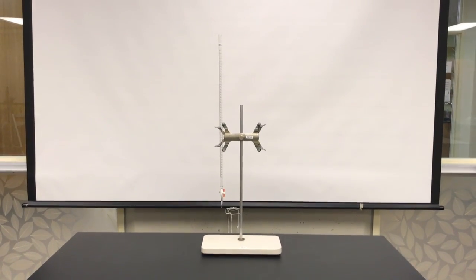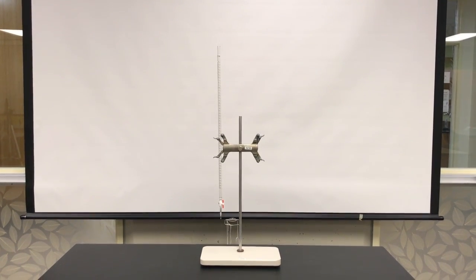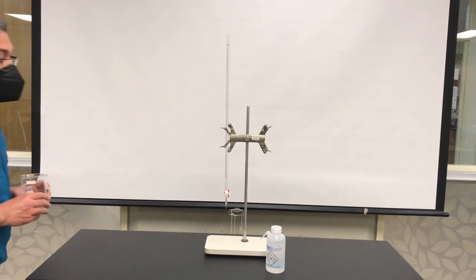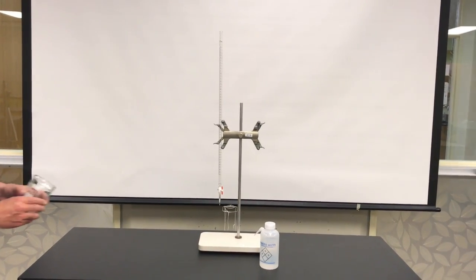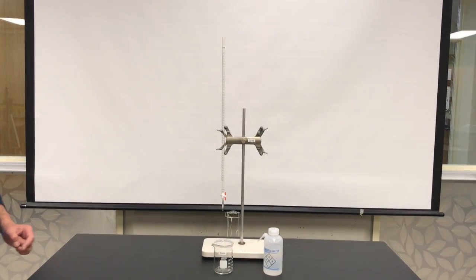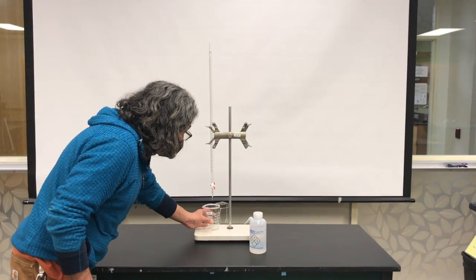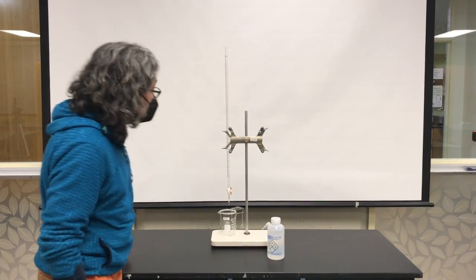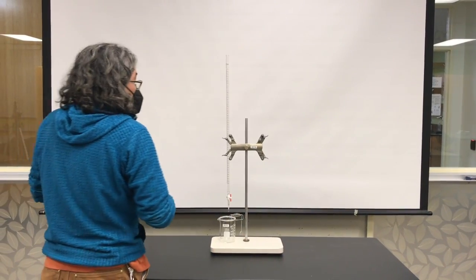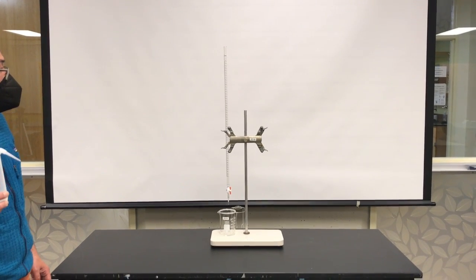I am going to rinse the burette 3 times with water. To do this, we're going to need a squirt bottle with deionized water and a 400 ml waste beaker. Place the beaker under the burette and you will rinse it 3 times with a small volume of water.